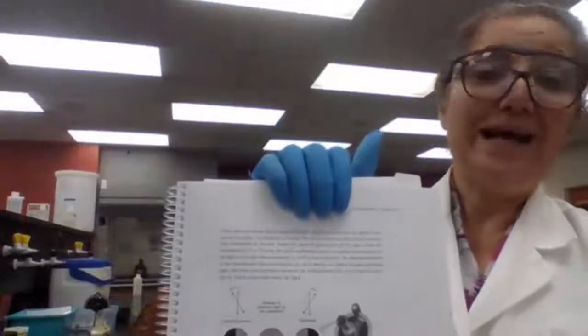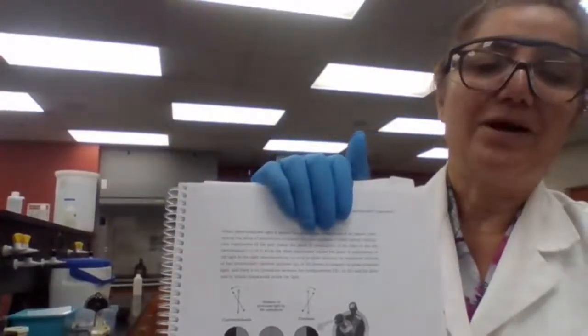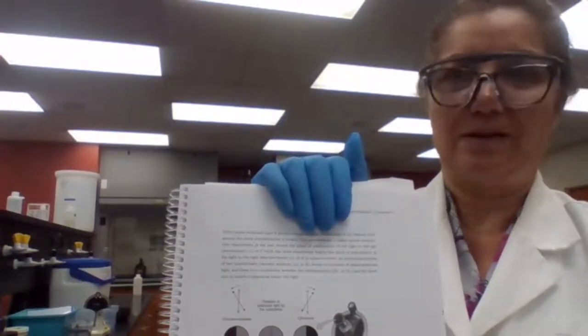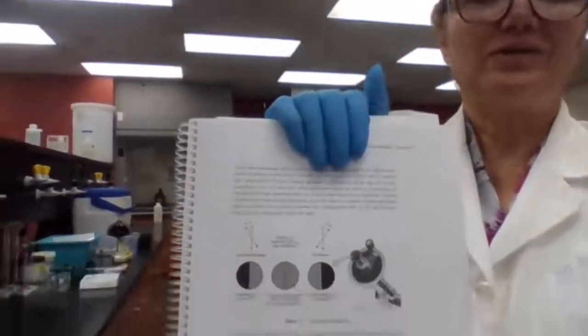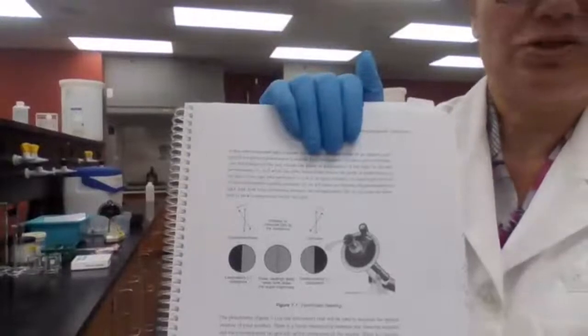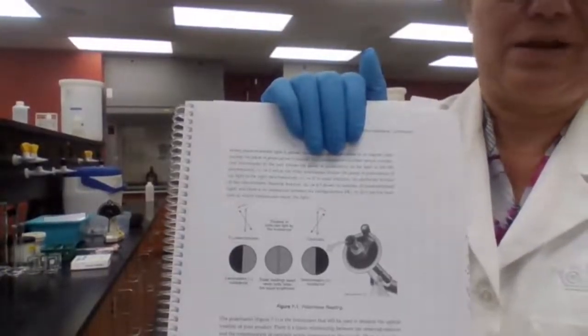When we separate this, I'm going to have to test it with the polarimeter. When we test with the polarimeter, we are going to see how efficient the separation was with the resolution technique that I used. That is going to be determined based on the observed rotation and the specific rotation of the final product that I have.